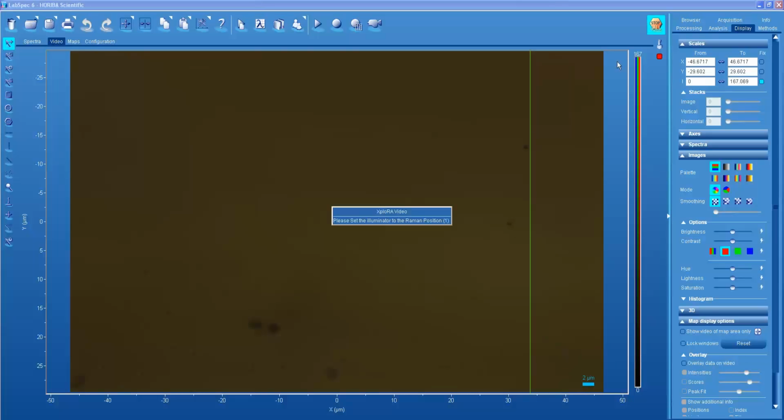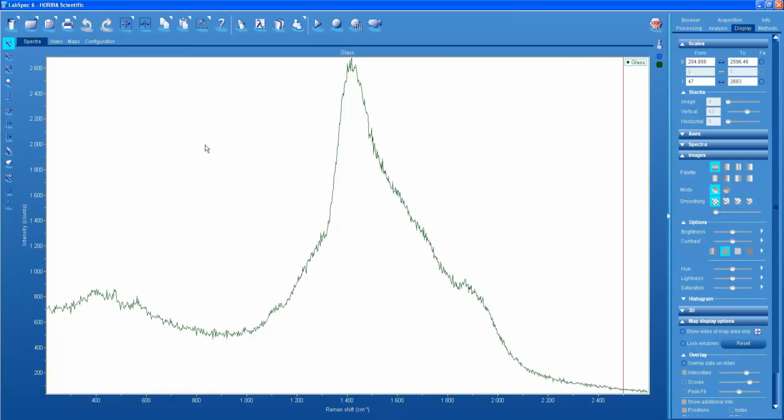And you can see I'm moving the glass slide and I've got a little bit of dirt on the surface, which can allow us to see that we're in fact in focus. Alright, now we stop the video, change to the spectral position, and now we initiate a real-time display. Alright, and now what do we see?